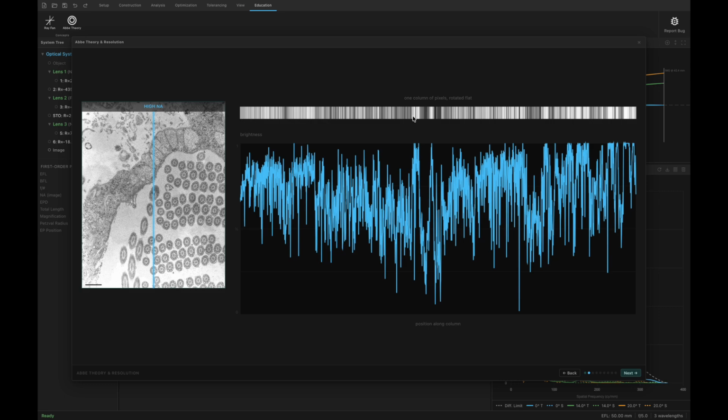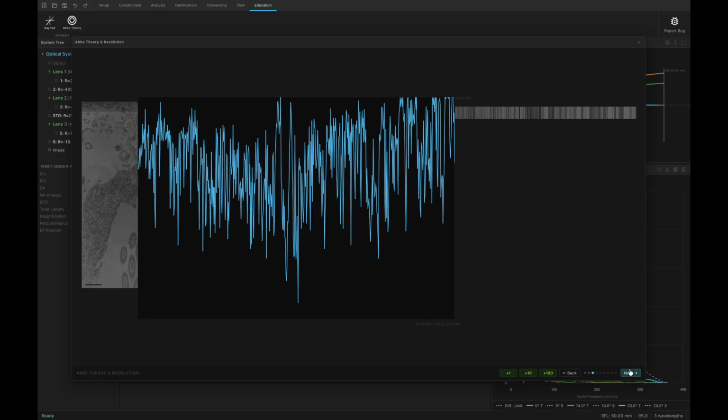And you can see that in the whiter regions, it's brighter, the value is higher, and in darker regions like this, it's lower. Now, this is important because of Fourier theory, which says that any function, such as this one, can be represented as an infinite sum of sine waves, which means that you'll take one sine wave of frequency 0, one of frequency 1, one of frequency 2, and if you stack all those on top of each other, and you have each one with a certain offset and a certain strength, you're able to reconstruct any waveform, including this one. So let's take a look at what that looks like.